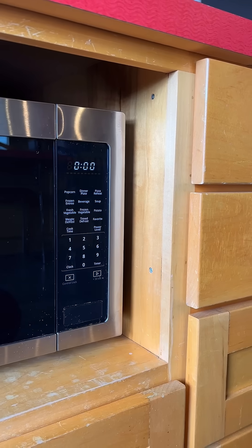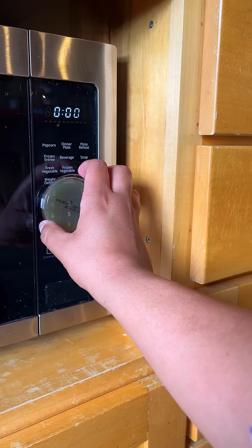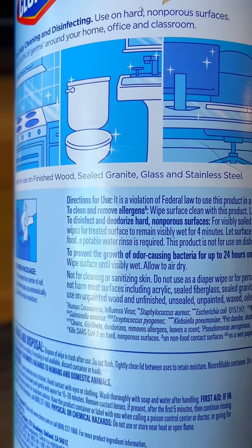Fast forward 24 hours to test the wipe's claim to prevent bacteria growth for 24 hours. We do another contact plate to the surface to see if the germs have stayed or gone.